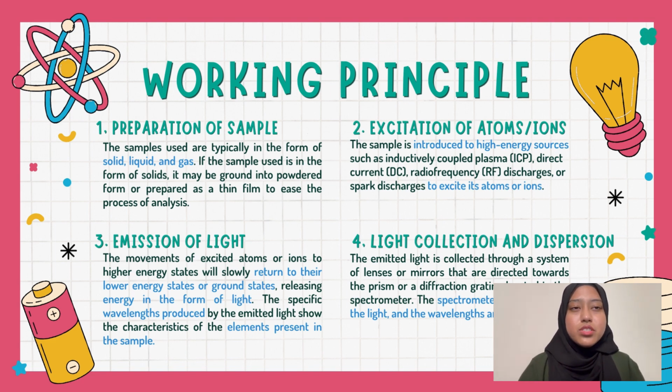Next, moving on to the emission of light, the excited atoms or ions at higher energy states will slowly return to their ground state, releasing energy in the form of light. This will subsequently produce specific wavelengths which can show what elements are present in the sample.